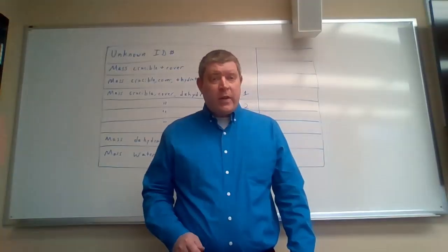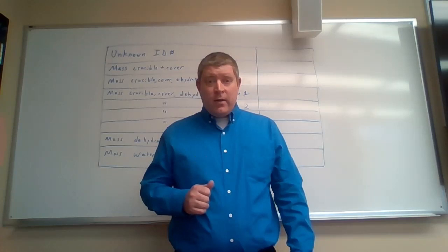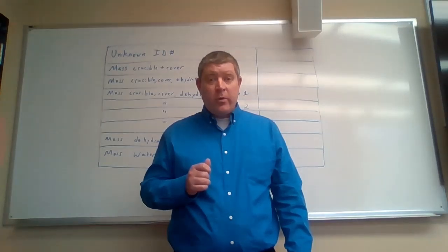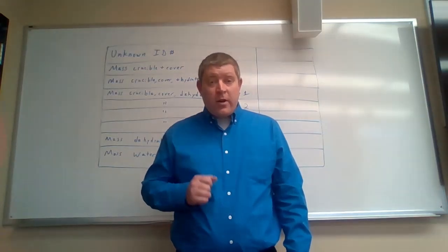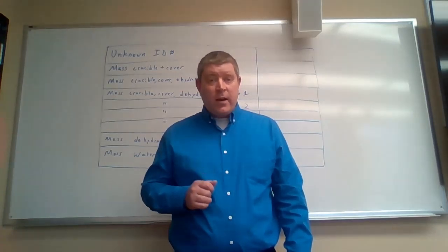So let's talk about the safety hazards involved in this lab. First is heat. You're going to be heating that crucible, and you're going to be heating it pretty hot. So make sure you're always using crucible tongs when handling the crucible and the cover. Also, all of those unknown compounds are skin and eye irritants. If any of those compounds touches your skin, wash the affected area immediately.